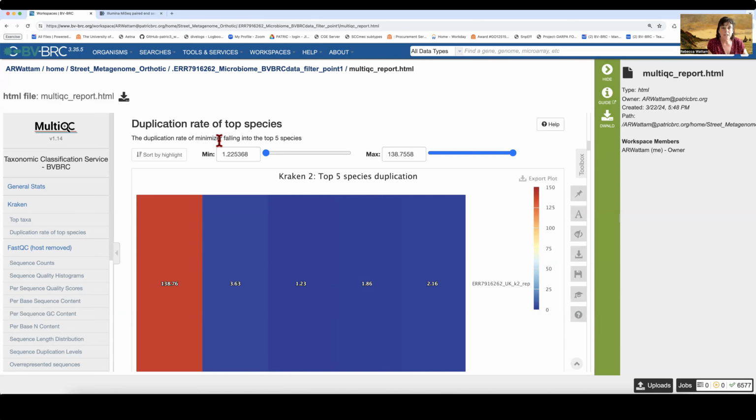So we have k-mers and m-mers, and the k-mers are all unique, but the m-mers, the minimizers, a number of k-mers can be lumped in with one minimizer, but the m-mer should be specific for a particular taxon, whatever you're looking at.